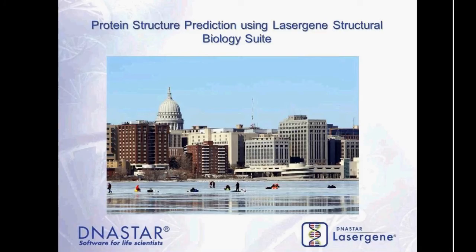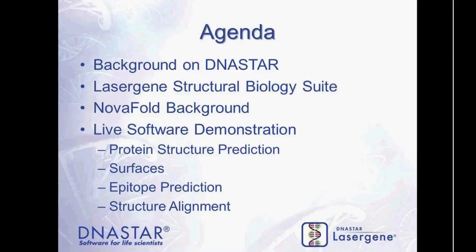So to go over what we'll be discussing today, I'll first be giving this presentation, including some background on DNASTAR as a company, our Lasergene Structural Biology Suite, which is our software package containing the applications you'll be seeing today, and some background information on our NovaFold application. Then I'll be getting into the software itself, giving a live demonstration, showing you how to set up and run these protein structure predictions, as well as some protein workflows within Protein 3D, which include working with surfaces, epitope prediction, and some structure alignment.